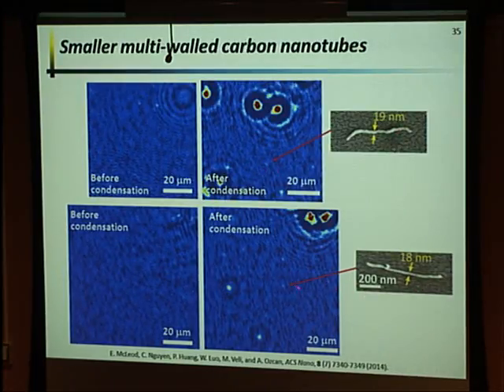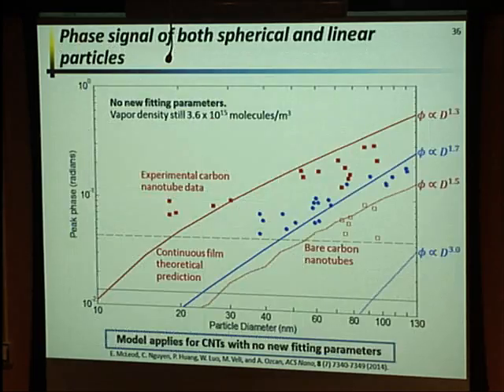So these are things that are beginning to become a bit questionable if you look at them. Is this really an object? Is it a spot of noise? But I don't know, if you have a little bit of belief, you might be able to see an object. But this gives you the limit of where we are in terms of that size.